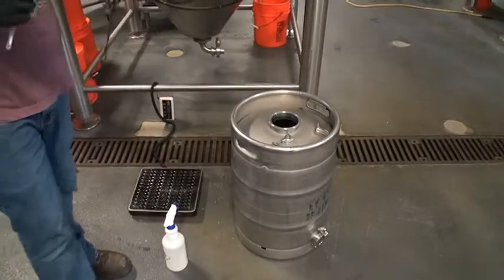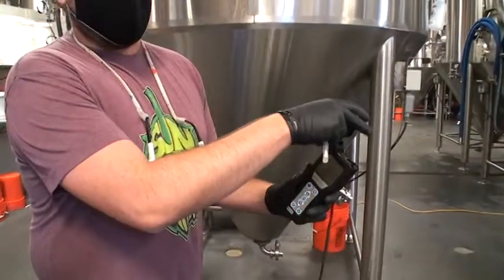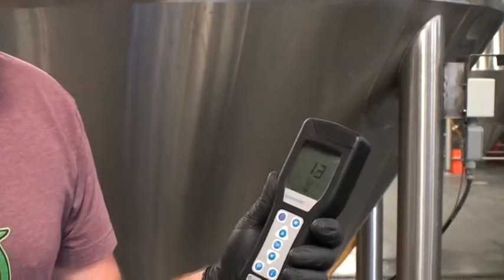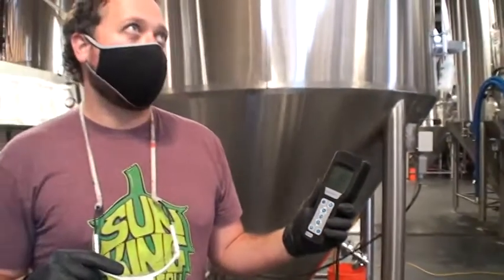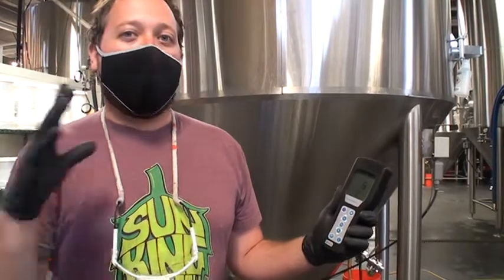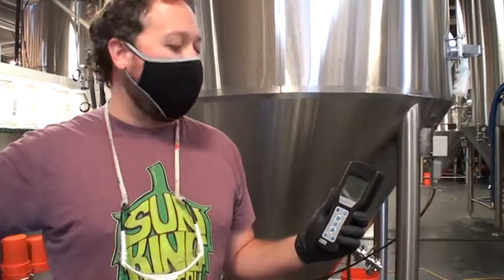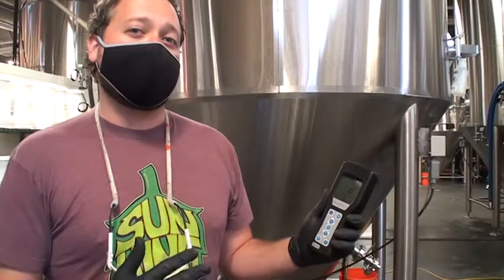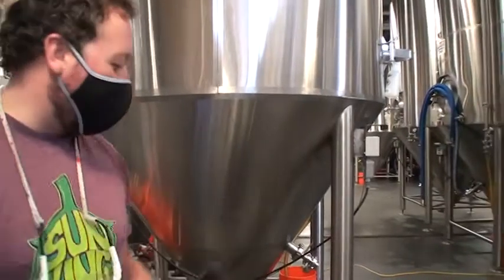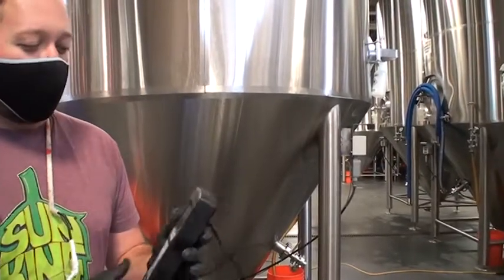Full. We're going to open the top of it up for a swab in there. Hit okay, and measure 15 seconds. And it gives a reading in RLUs, relative luminosity units. So the higher the number, the more compounds are in there. Below 10 is considered sterile. 11. So, yeah, close enough. I did open it up, so it's probably myself that messed with it.